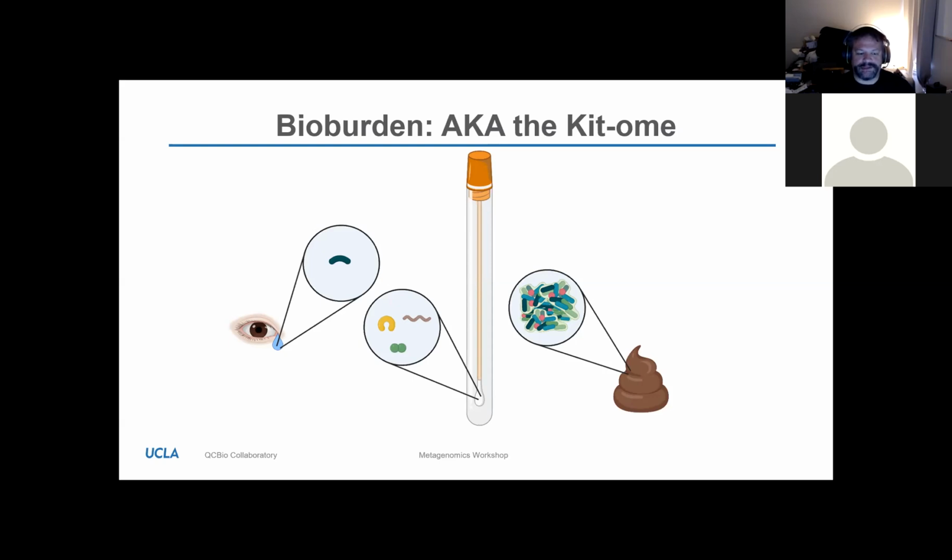Another issue with beads is also just how they're prepared. If your beads are covered with biofilm, or if your beads somehow passed through a dirty area, your beads are potentially going to have microbes on them. Same general idea for swabs. And I know this was recently a big topic in the news when the president was surprised by the fact that the swabs you need for doing microbiology testing are different than, say, the Q-tips you buy over at Rite Aid.